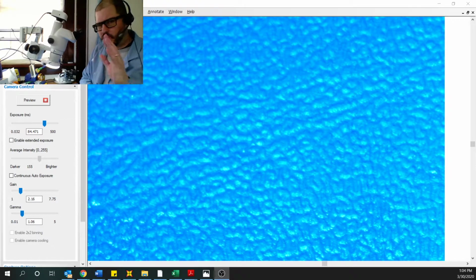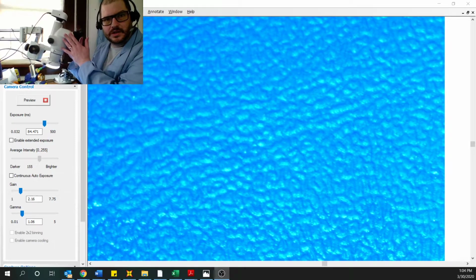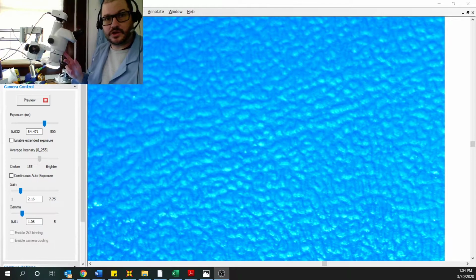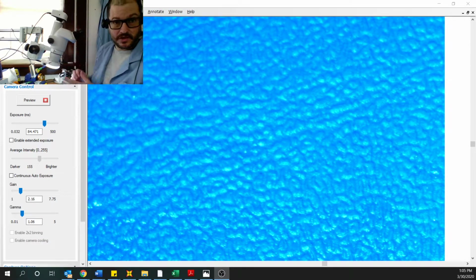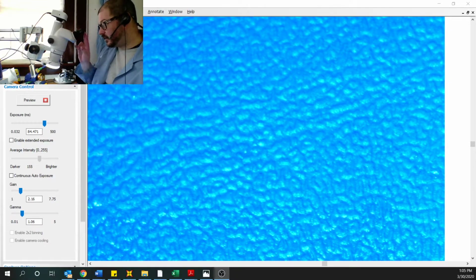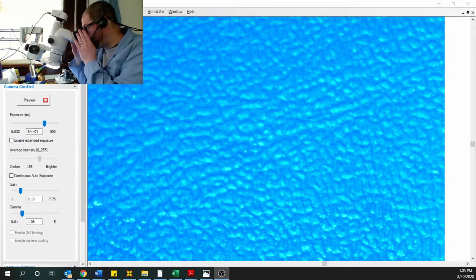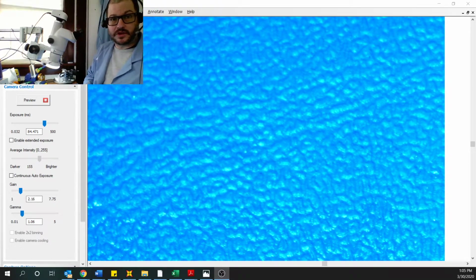Most microscopes all contain the same types of parts, although sometimes they're in different places depending on the type of microscope that it is. The one that we use within everything that I do in these videos is called a stereo microscope. The whole thing is called a stereo microscope. That word stereo comes from the fact that there are two eyepieces, which is what I use to look down and through at what I want to look at underneath the viewing area.